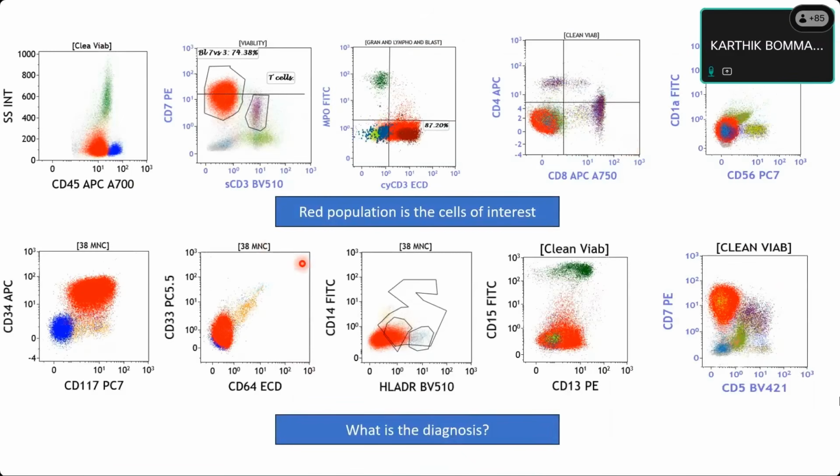Okay. Now, Dr. Ruchika, what is CD45 expression? In blasts, sir, it's positive, and the level of expression is below my internal positive control, which is my lymphocyte. So it is dim expression, right? Yes, dim. Reaching here it would be moderate, but it's a bit behind. So CD45 is dim expression here, almost the same as neutrophils.